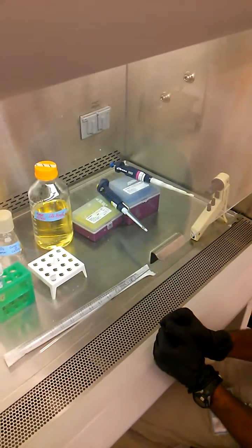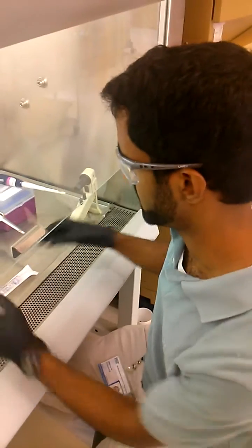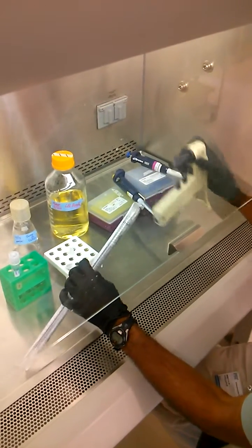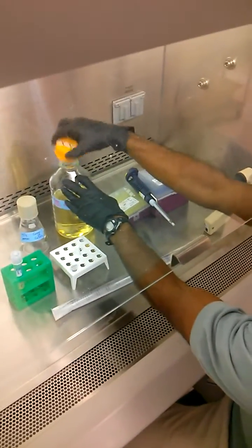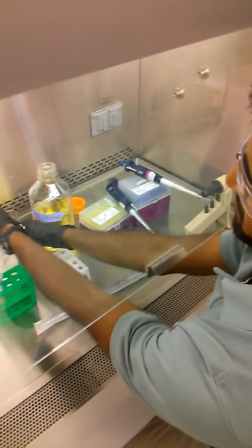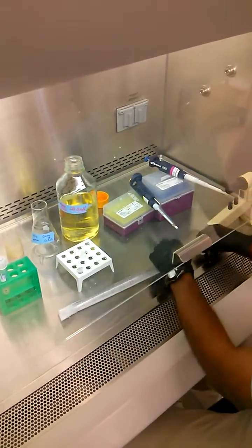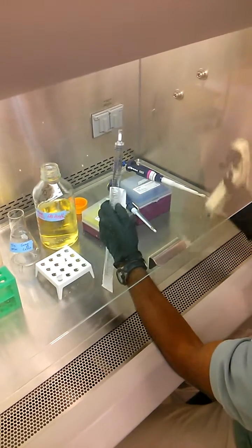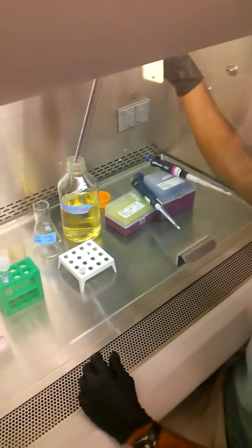When making cells competent, we want a sterile environment. I've brought everything over to the hood and I have a large pipette. I'm going to pipette 50 mils of LB broth into this sterile flask using sterile technique, so I'm not touching anything that will come in contact with my cells.